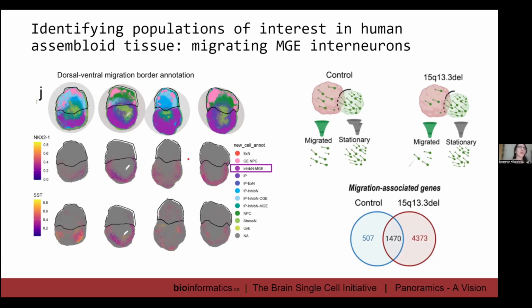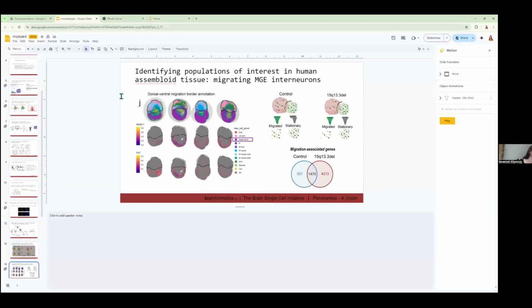So I'm going to exit this PowerPoint and move to my RStudio. Don't mind the mess. And this is unfortunately not something we can provide within our own RStudio, just because the package is very much in the development stage, and so it's very buggy. It's challenging to use at the start, and by that I just mean you need to do a lot of pre-processing. So for those reasons, I just want to do a demo just to show what's possible with this package.